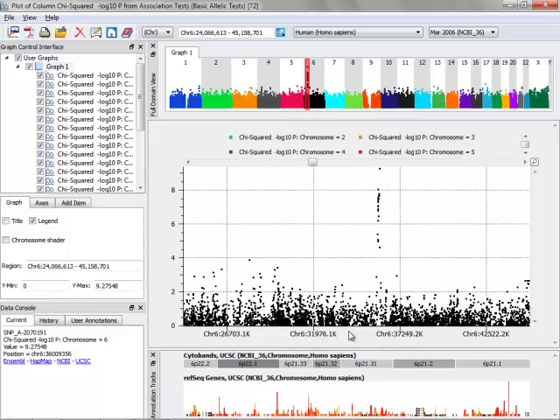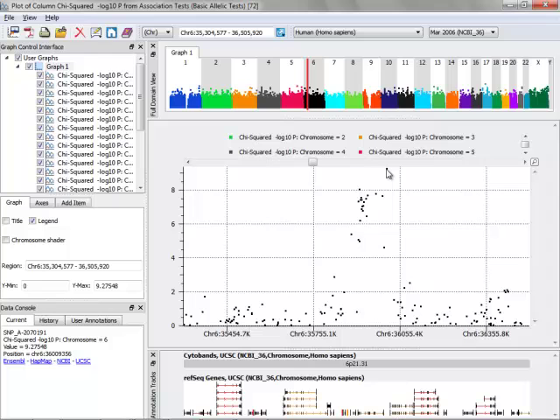So you can see that this region has many significant markers in it. The most significant one here is almost 1 times 10 to the negative 9th. I can actually see that by clicking on that point.